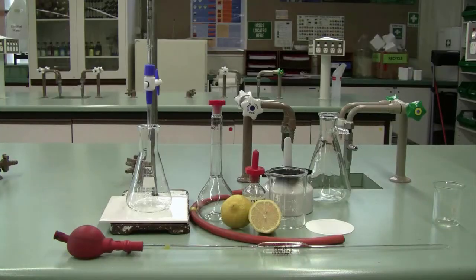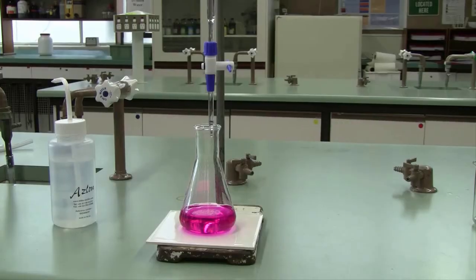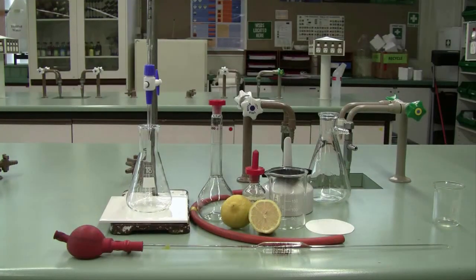Just finally, before we talk about your report — I often see this color around the lab: this bright fluorescent pink is not the color you're looking for. If you see that in your sample, you have overshot the endpoint.